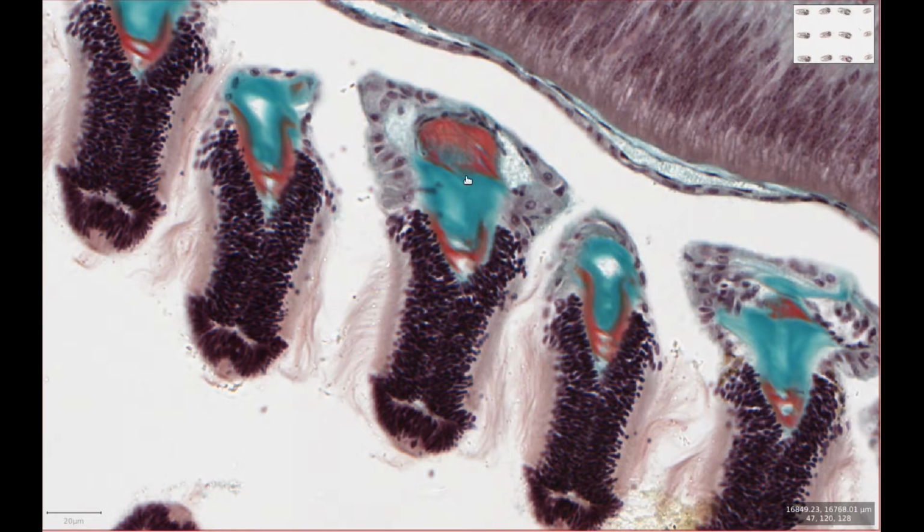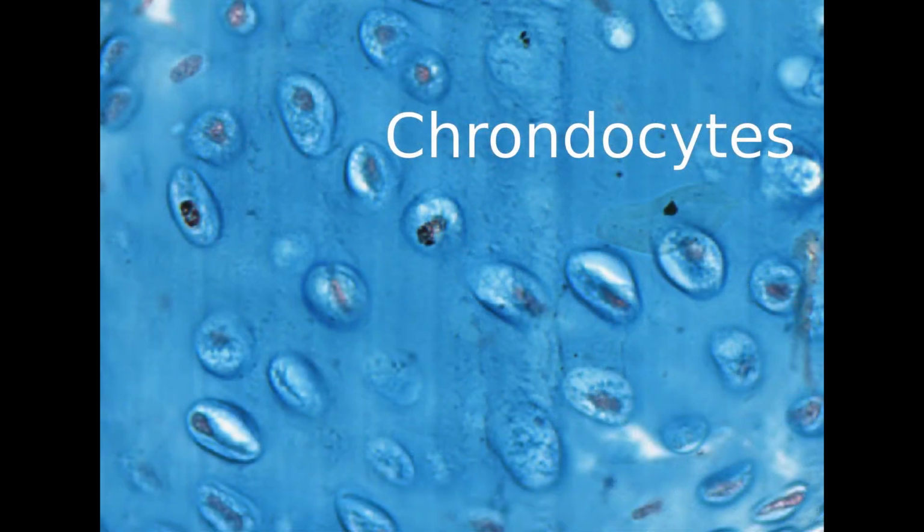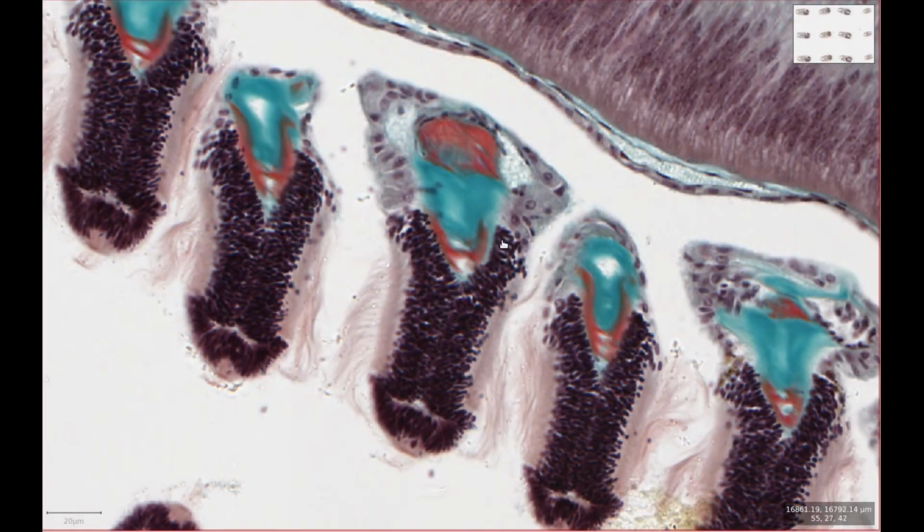But there's a difference with higher animal cartilage in that it's very acellular. So for example, if you go and have a look at a section of fish and you look at the cartilage, you get these wonderful chondrocytes or cartilage producing cells within little spaces called lacunae, but this cartilage is acellular. So what's happening is the cells around the edge are producing the collagen and the proteoglycans, but they're not surrounding themselves with it as they would in higher animals.